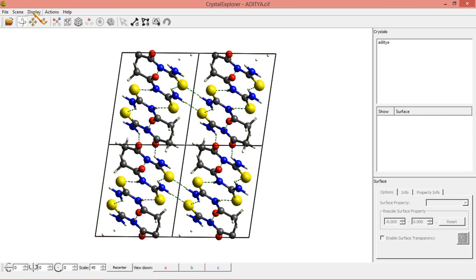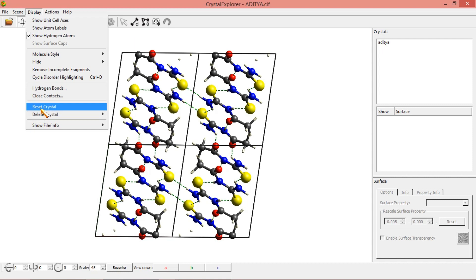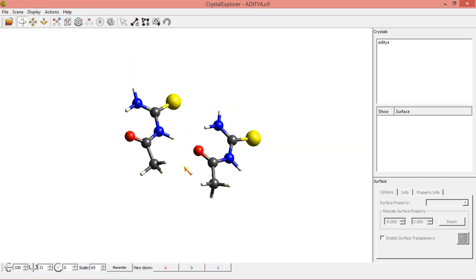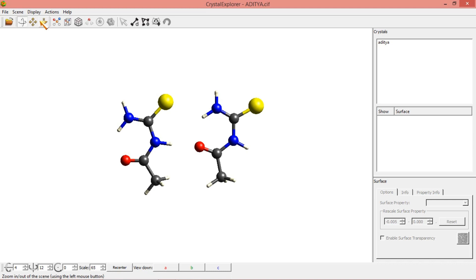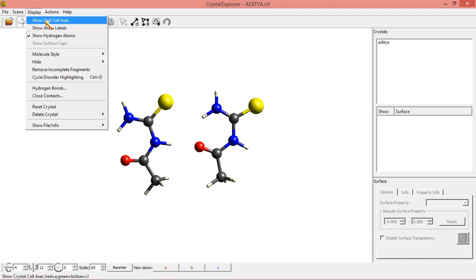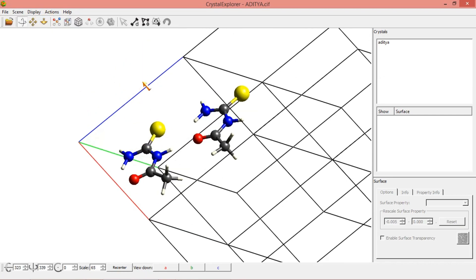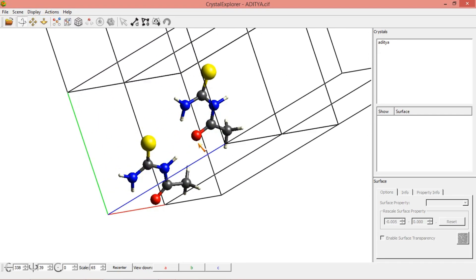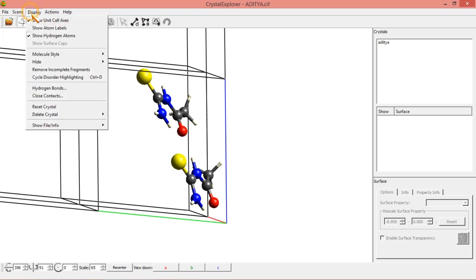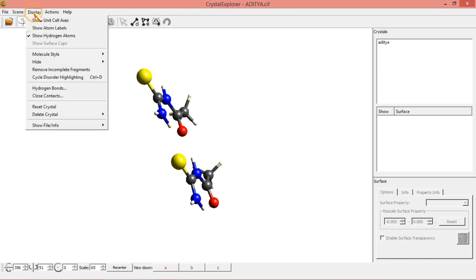Here I am going to reset again. Let me show you the inter and intramolecular interactions between these, each one by one. I am just showing the cell axis in a unit cell. You can see how many molecules are visible here. Now I am removing that.